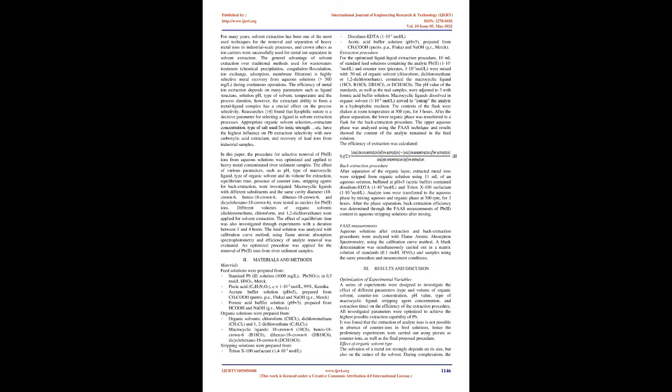The feed solution was analyzed with the calibration curve method, using flame atomic absorption spectrophotometry, and the efficiency of analyte removal was evaluated. An optimized procedure was applied for the removal of Pb²⁺ ions from river sediment samples.